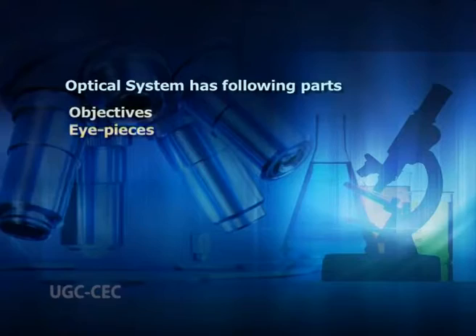Unlike air, immersion oil has the same refractive index as glass. Therefore, it improves the quality of the image. If immersion oil is not used, the image appears blurred or hazy.